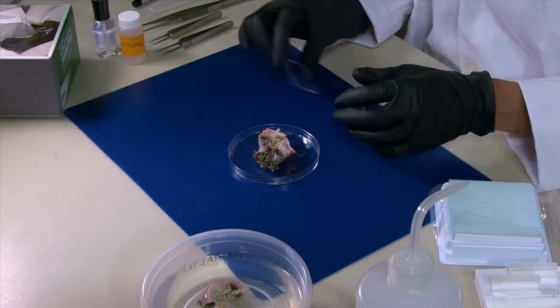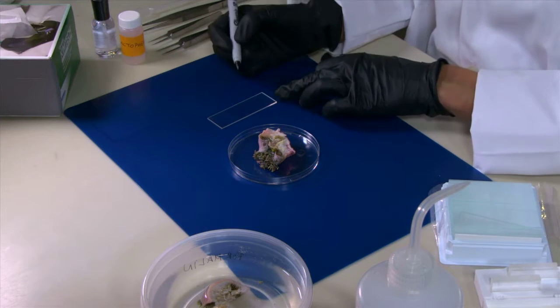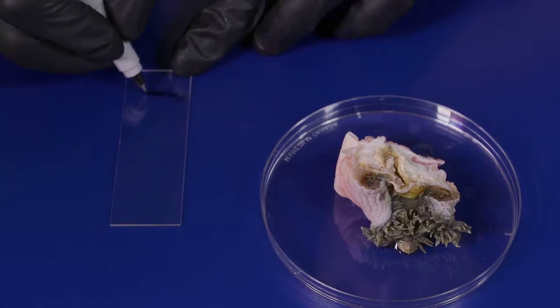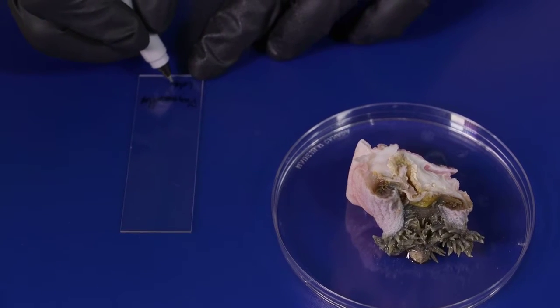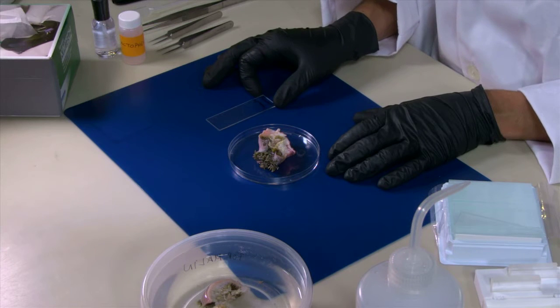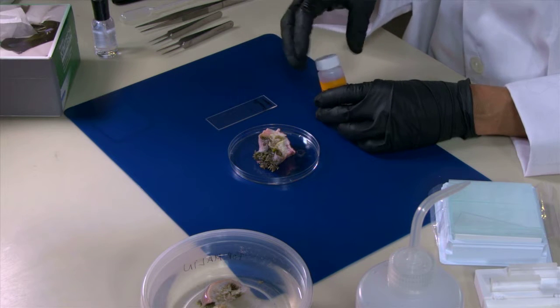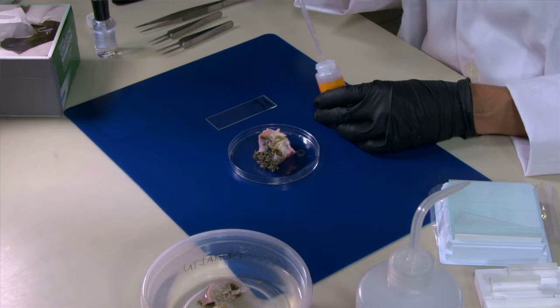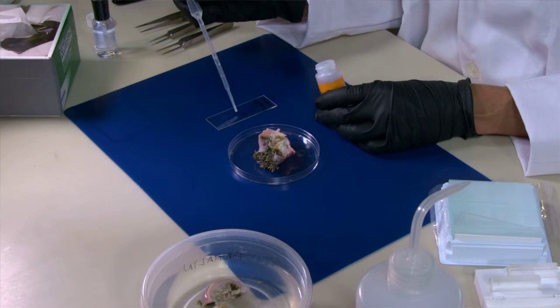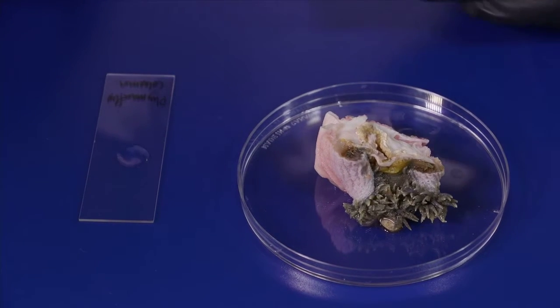We will start our preparation by taking our slide and labeling it. It's important to put your specimen label on the part that you are going to do the slide from. When your slide is labeled, you take your solution of lacto-phenol and put a drop on the slide. Lacto-phenol is toxic so you should handle it with care.